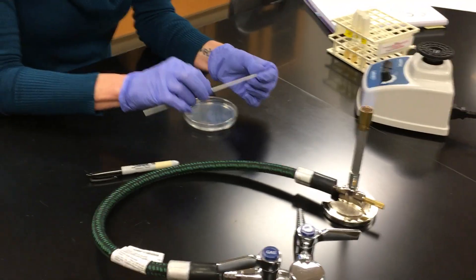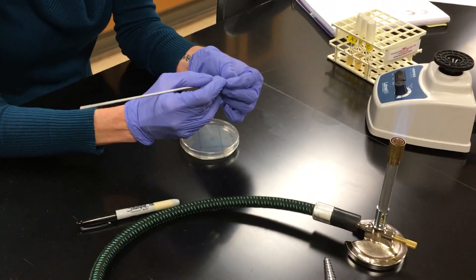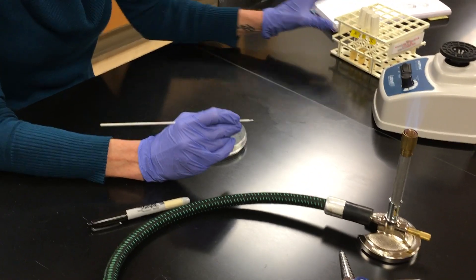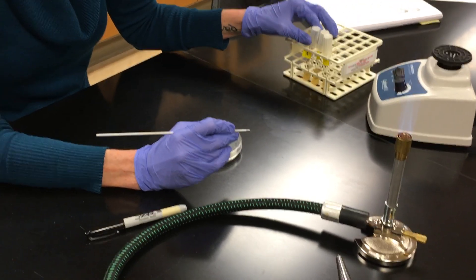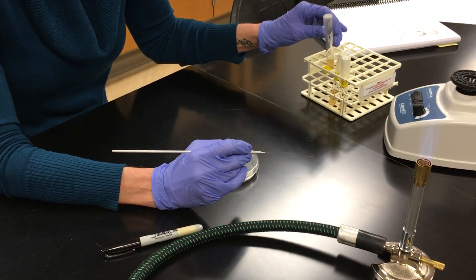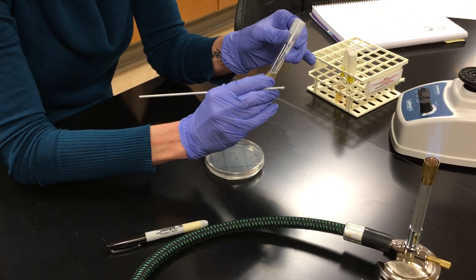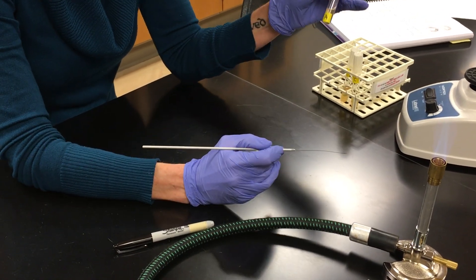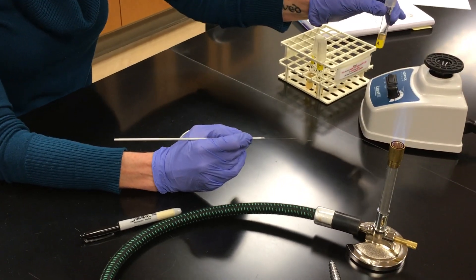You want to take your loop in your dominant hand and you want to hold it just like a pencil. So we're going to do that. We are going to take our culture tube. Oh, my little label came off, but that's okay. It's still culture tube A. And we're going to go and we want to mix these. And so that's what the vortex is for.